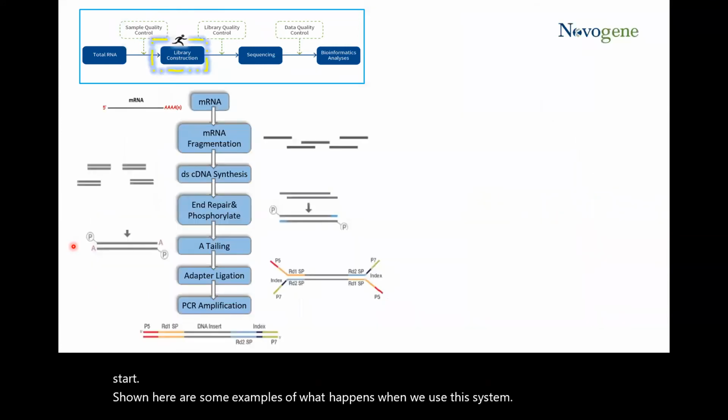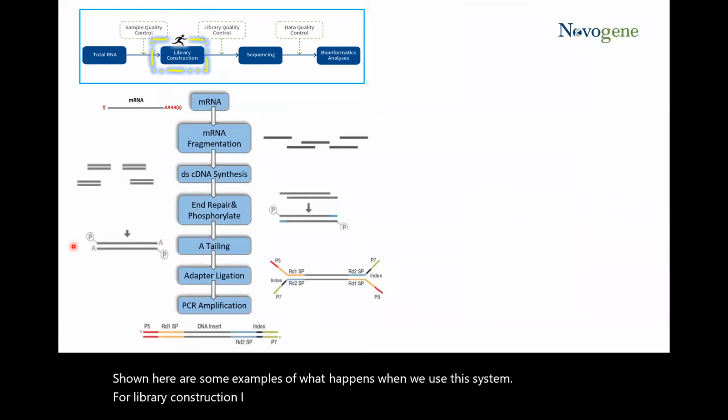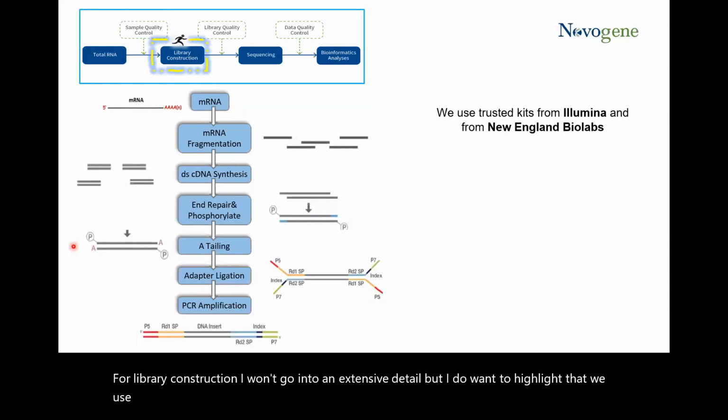For library construction, I won't go into extensive detail, but I do want to highlight that we use trusted kits from Illumina and New England Biolabs.